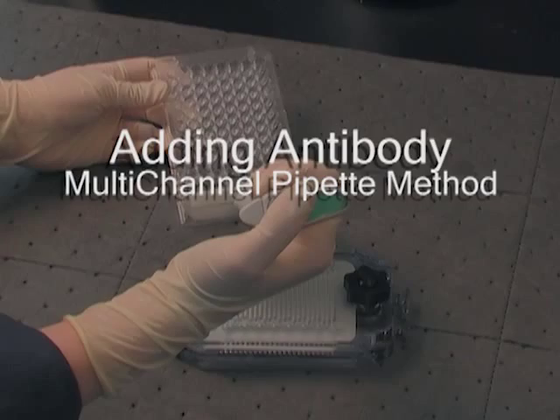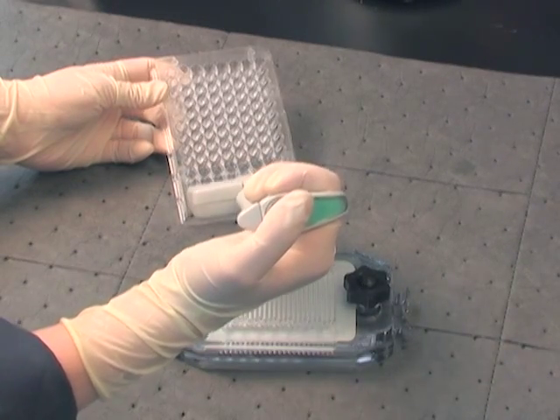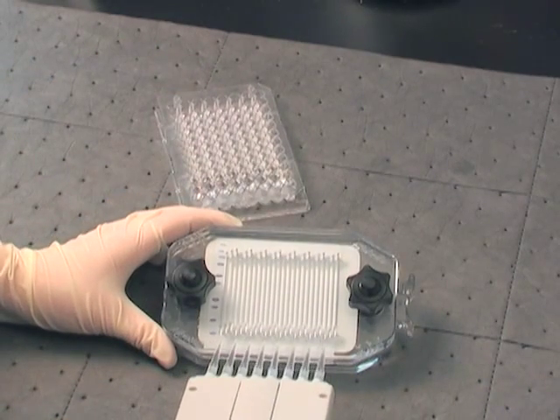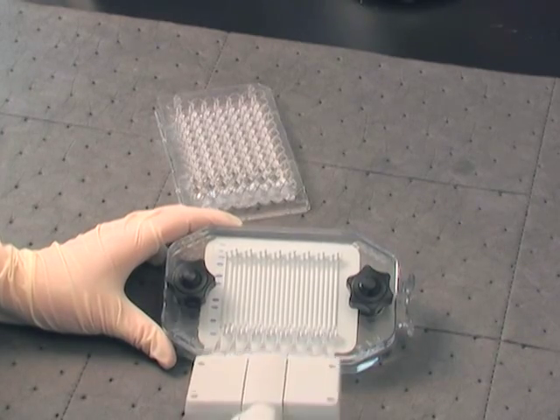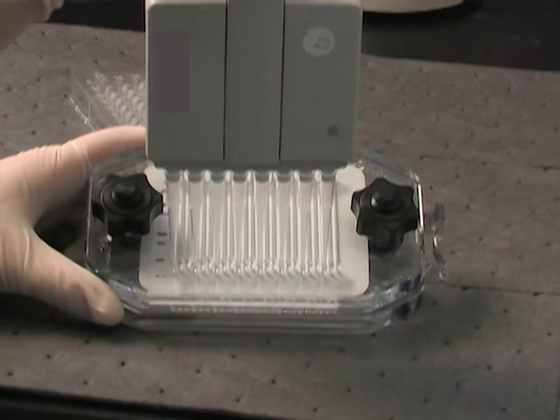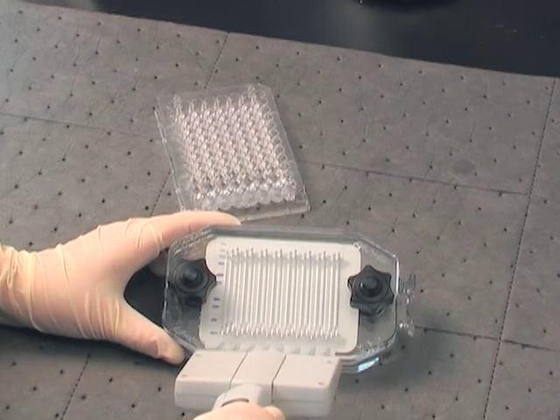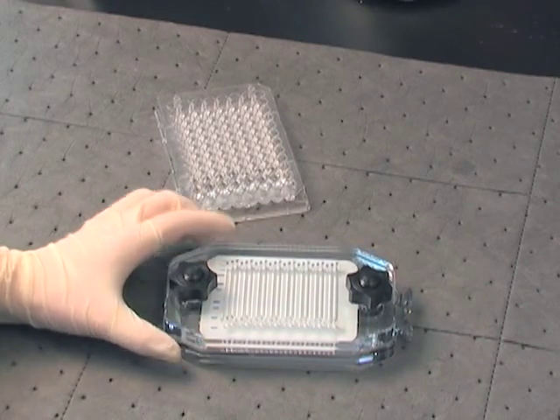Again, adjust the pipette to approximately 200 microliters and fill with diluted antibody from a 96-well plate. The MPX was designed so that the multi-channel pipette tips fit into every third hole. Align the MPX with the first set of staggered holes, slide into position, and depress the plunger. When the liquid reaches the top and can be seen in the round port, stop filling. Keep the pipette plunger depressed, remove the pipette from the ports, and finally release the pressure on the plunger.